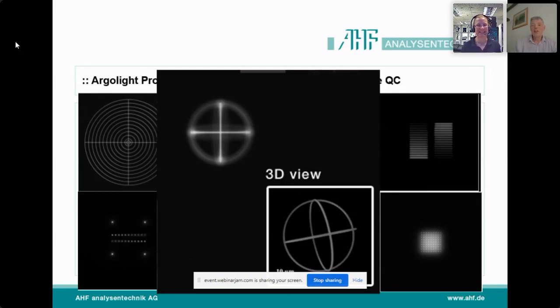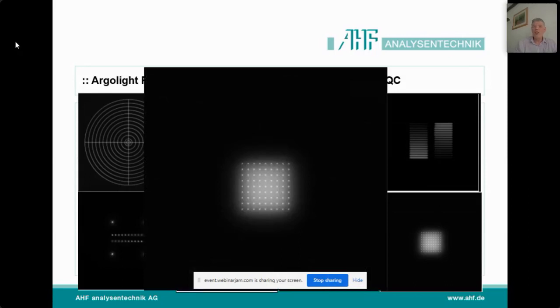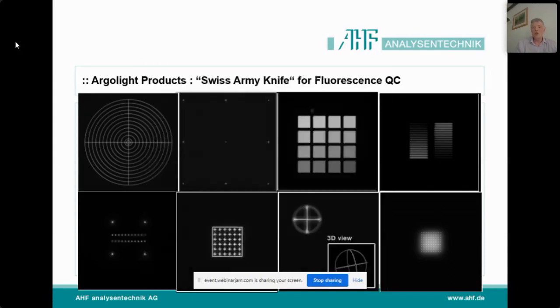Okay, so there's an orthogonal view here of 3 circles, and it's to test reconstruction of circles, so depth and 3D reconstruction on confocals or Z systems. This is another set of rings, but it's got a pattern underneath at a depth, so you can test your structured illumination and super resolution systems.